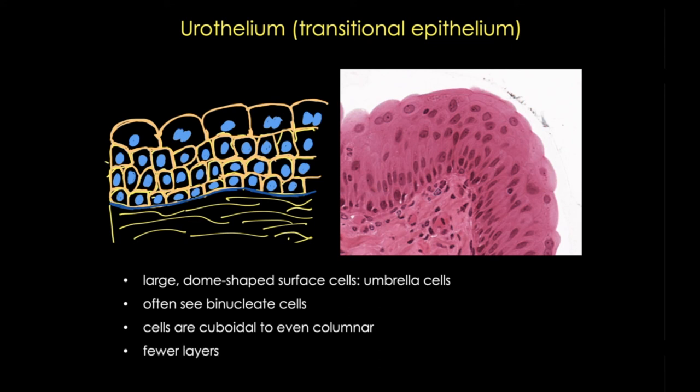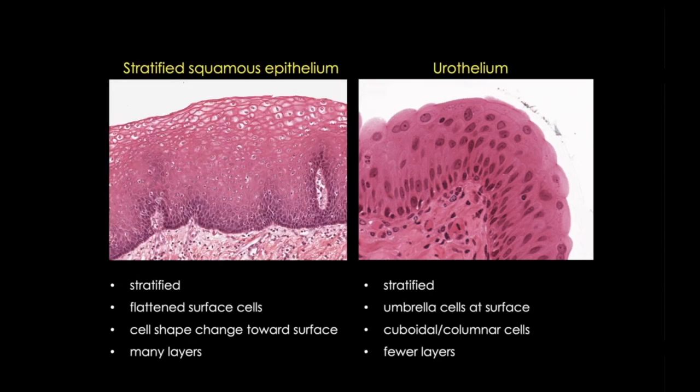Overall, urothelium will have fewer layers than stratified squamous epithelium, but the walls will become thicker the closer you get to the bladder. Urothelium is never keratinized. So let's recap and look at these tissues side by side. Both tissues are stratified, but their apical surface cells look very different — with those flattened thin cells in stratified squamous epithelia and the characteristic umbrella cells in urothelium.